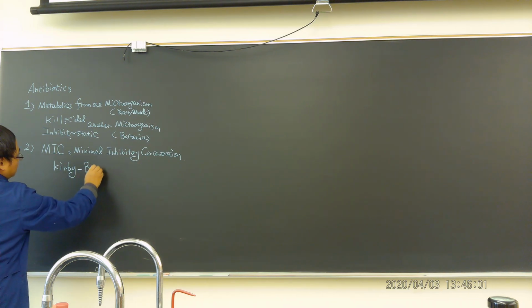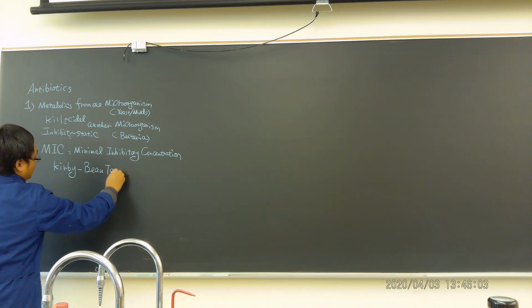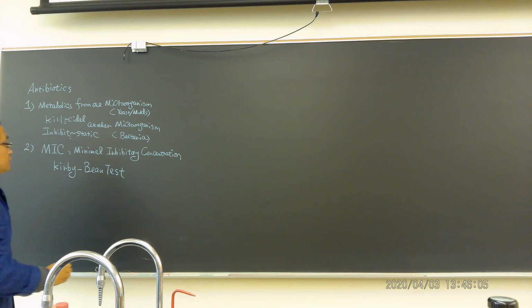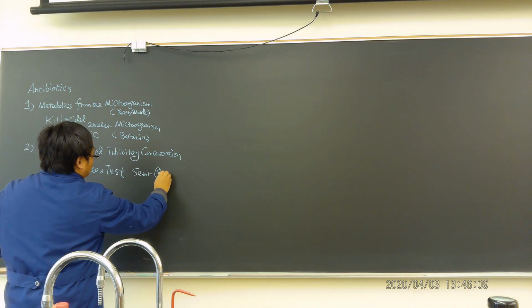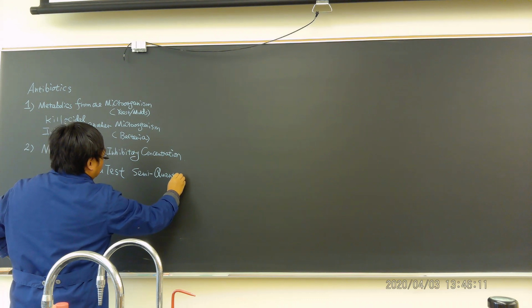We have several methods to do that, which were mentioned in the lecture. Today we will do the Kirby-Bauer test, and I say this is a semi-quantitative test.